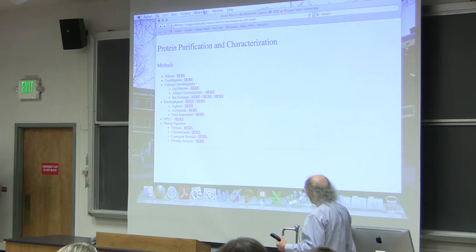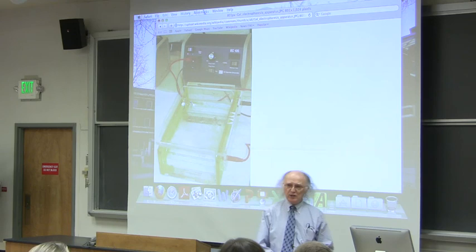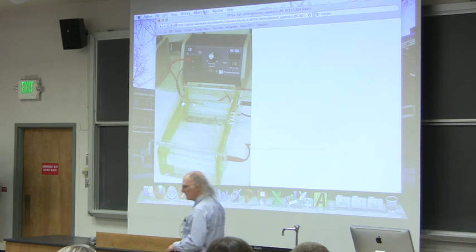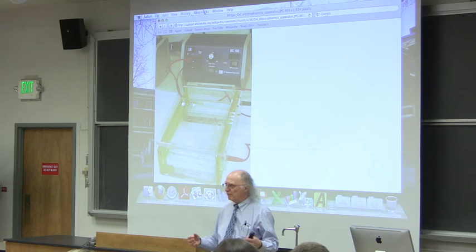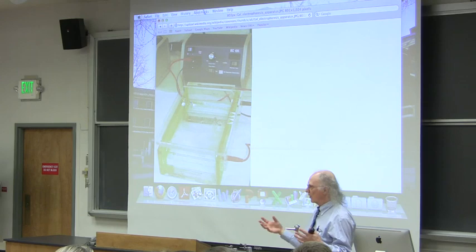I'm going to jump ahead and talk about a couple of technologies here, and then I'll finish for the day. So, how many people in here have done electrophoresis? Okay. So electrophoresis is a technology that uses gels. There's that word again. Okay. And gels are basically materials that are what I like to describe as fibrous. They're basically a support for water. They're called gels because they have a gelatinous appearance. They are not unlike Jell-O in terms of their sort of physical characteristics.